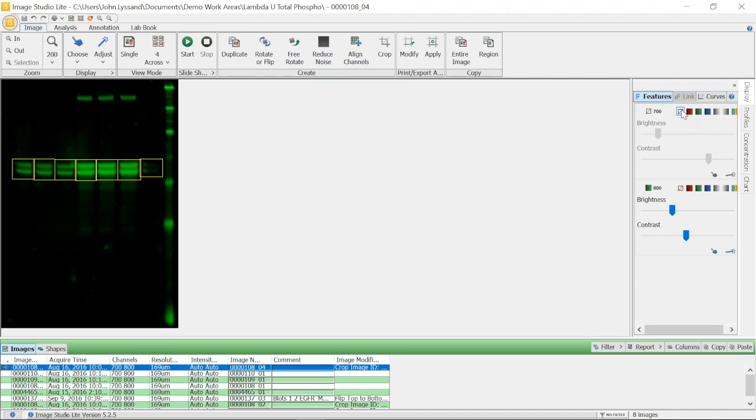After imaging these signals on an Odyssey imager, the image was imported into Image Studio Lite. For this example, we have already quantified the bands of interest. To recap basic features of how to quantify your own targets, please review the lessons covering basic quantification.